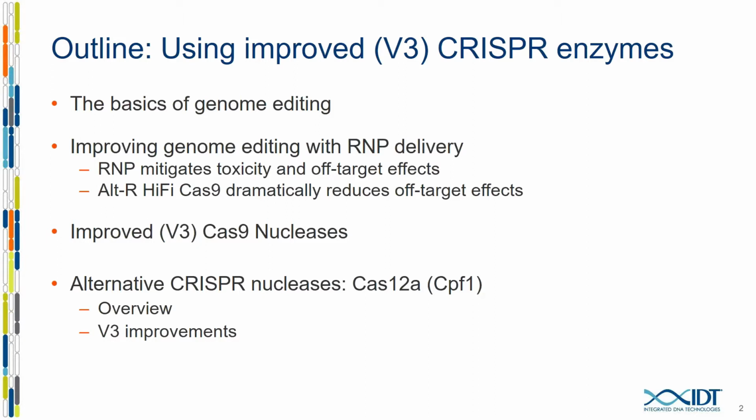Finally, I'll talk about our Cas12a, or otherwise known as CPF1 protein, the basic workings of that system, and then end on the various improvements we've made to that system, and again, show some data.